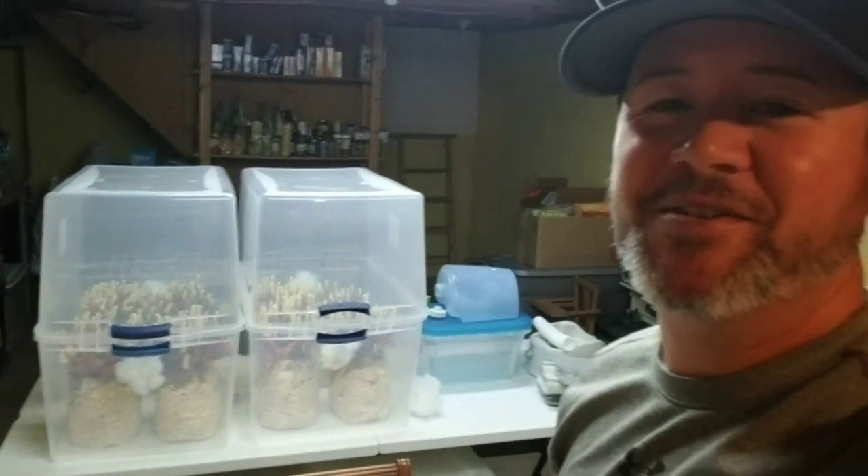Hey guys, welcome. We're back here in the grow room under the glow of the 6500K fluorescents. We have our reishi buddies keeping us company — they're looking good — but this video is going to be all about liquid culture.